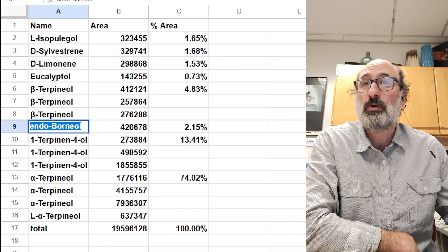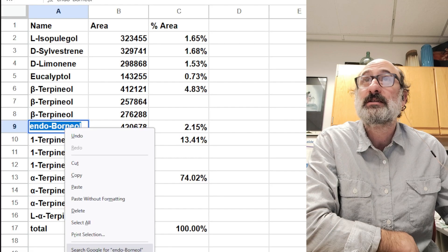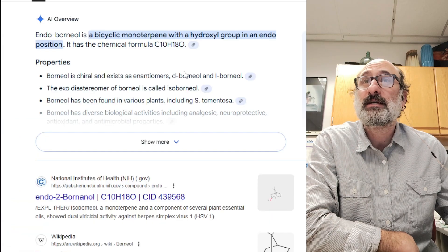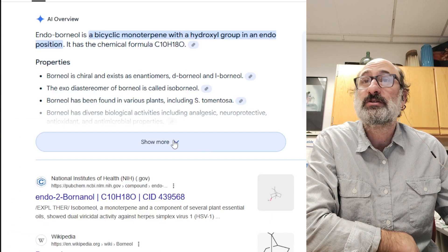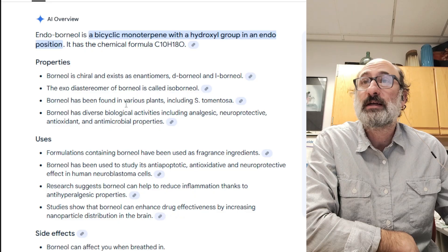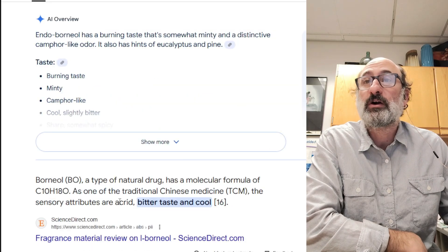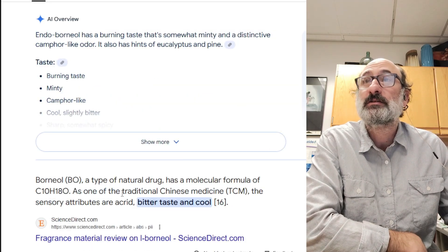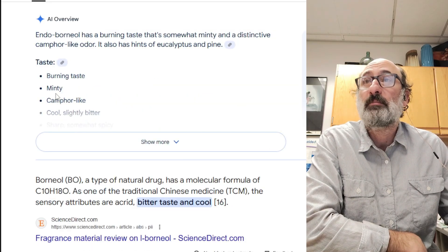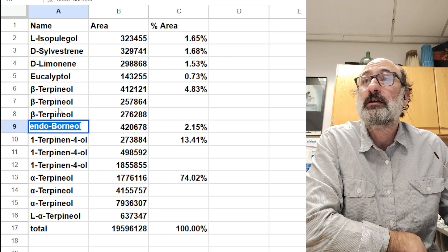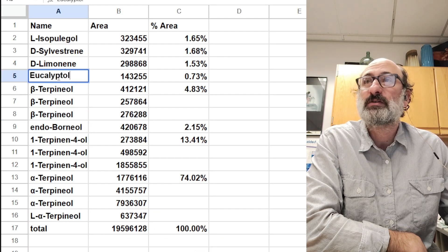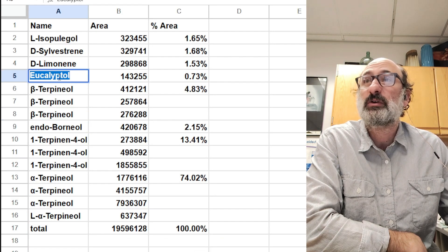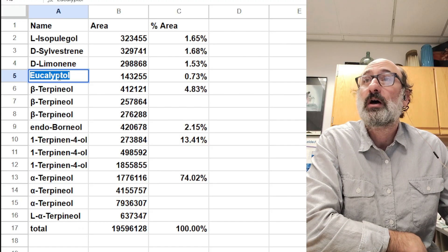So then we get into something kind of interesting. We have endo-borneol at a really small amount, 2%. This has different enantiomers found in various plants. Bitter, cool taste. Minty, camphor-like. It's just such nondescript flavors - I mean, that's kind of Coca-Cola in itself. It tastes like Coca-Cola.